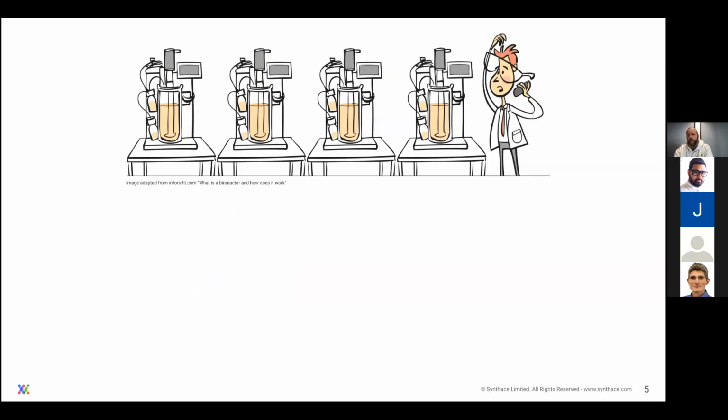It was during the first part of my career as a fermentation technician that I started to look at other ways of performing experiments. I was running a set of 4 bioreactors, and I would find myself looking at the impact of process set points on the biological system, and I wouldn't be able to make any sense of my own experiments. So my interest in the DOE methodology was born out of this frustration and me wanting to make better use of the limited resource I had available.